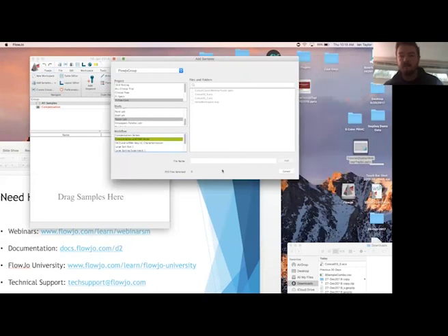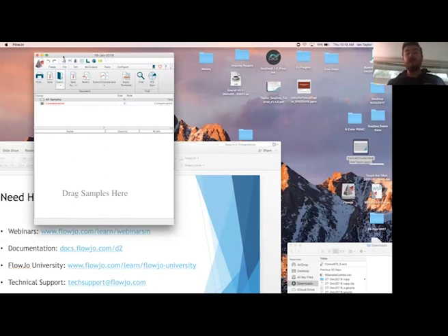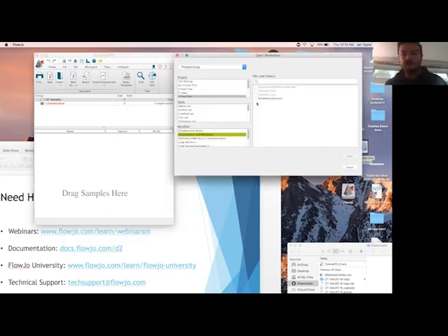I'm actually going to go back a step and load that workspace. So again, to access a workspace in Envoy, if I go to the File tab, I can open from Envoy, and just take a moment to ping the server and then give me back that browser window. Maybe more than a moment. And this is just a workspace where I've preloaded some demo data that I'd like to go ahead and gate and then concatenate and run the t-SNE calculation on. There we go. Demo workspace, that's what I want.